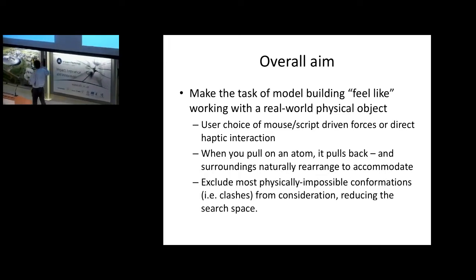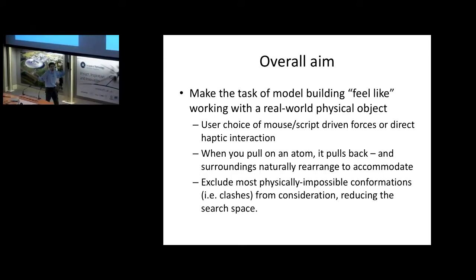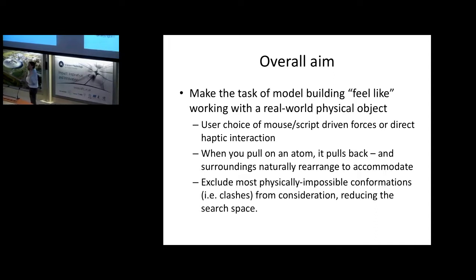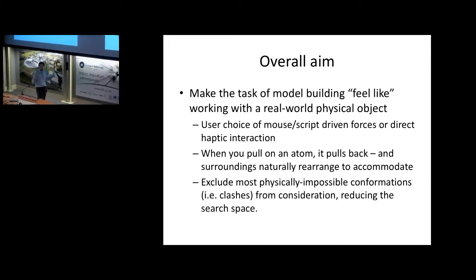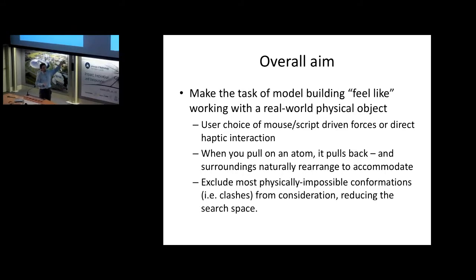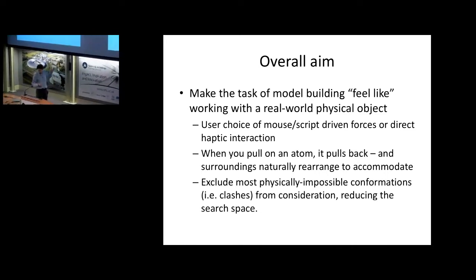It's almost paradoxical, I guess, but the more physically reasonable restraints you add, and these non-bonded interactions are essentially a form of extra restraint on your simulation, the more freedom you actually have to interact with this thing, because it won't let you pull things into configurations that are truly wrong. It won't let you create atomic clashes. And if you pull it into something that is very energetically unfavorable and let go, it'll go straight back to where it was.